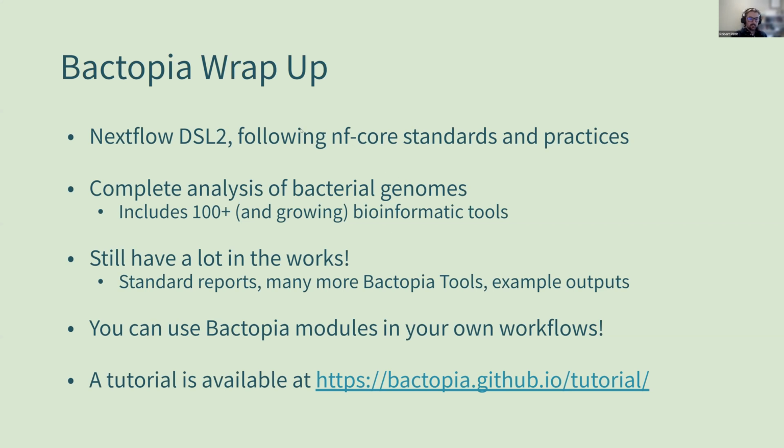And yeah, so Bactopia follows the NF Core standards and practices, which it's not an official NF Core pipeline, but I think following their practices and standards to some degree has really made it easier to maintain. It's for your complete analysis of bacterial genomes, whether it's Illumina or Nanopore. I still have a lot I want to put into it, including standard reports, many more Bactopia tools, and example outputs from each of these tools.